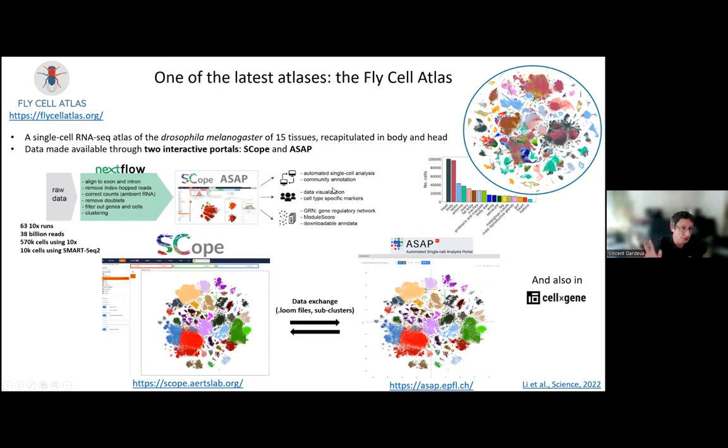So that's what you will work on. I know it's not human, it's not mouse, it's Drosophila data. I guess it was a good thing. So maybe none of you have worked with Drosophila already. So it's a kind of new thing. Then you can see the power of ASAP and how you can actually do this analysis pretty straightforwardly.